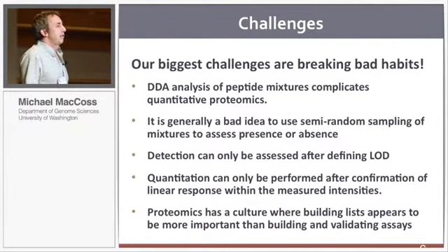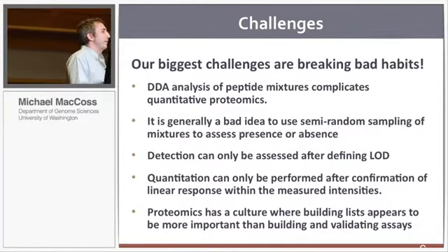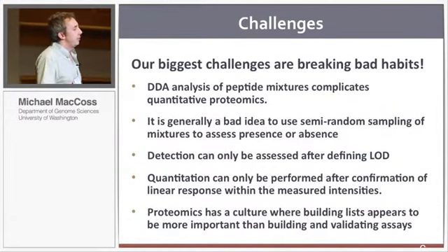So what do I think some of our challenges are for proteomics? If our goal is ultimately trying to compare very large numbers of samples between large numbers of conditions, and to be able to do this in a robust way where we can compare between days, between weeks, and between labs, it's actually a really complicated problem. And so I think some of what we have to do is unlearn some of our so-called bad habits. So bear with me for a little bit.